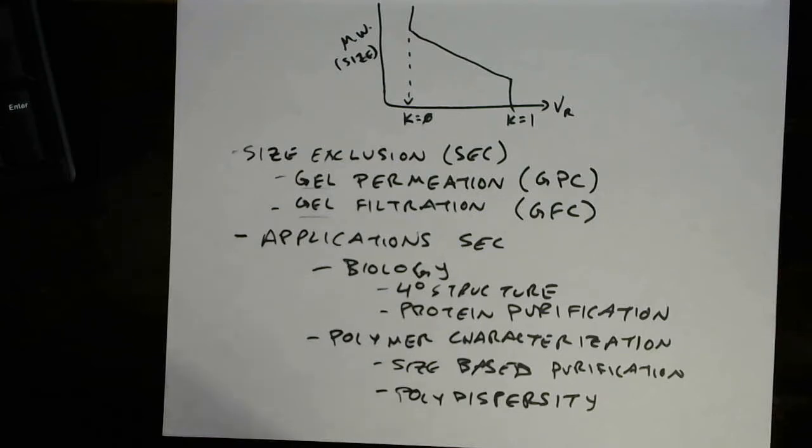If you are not a polymer scientist and you don't understand polydispersity, that's okay. We're not going to learn it here. But understand that this is another major application for size exclusion chromatography.